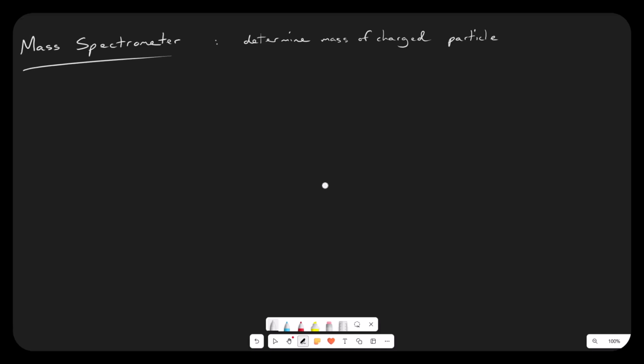I'm going to do the first half just talking in a physics sense about the mass spectrometer, and then in the second half I will swing around and do an example of using this in an organic chem setting. And I will make sure in the middle to provide you with a spot where I say this is the end of the physics part and kind of the end of what you need for this course. From here forward, this is an application that you might use, especially in organic chem, though it may be helpful to see it worked out for this course also.